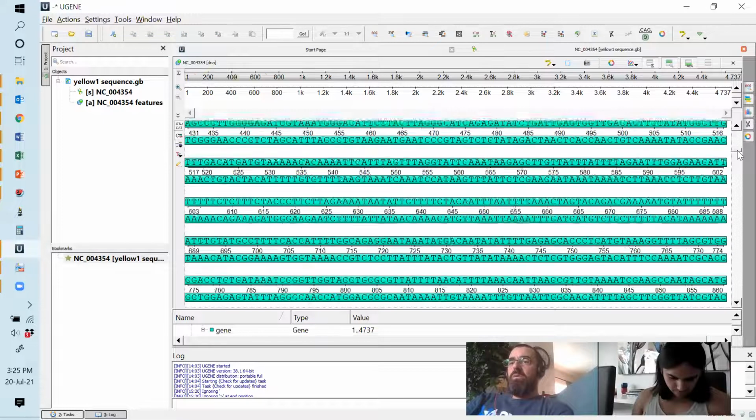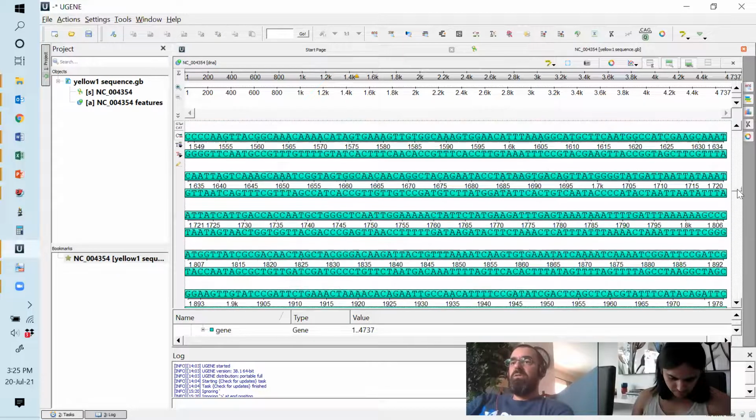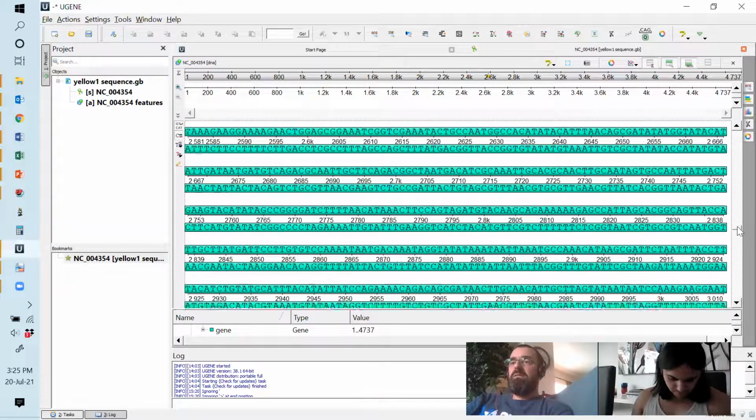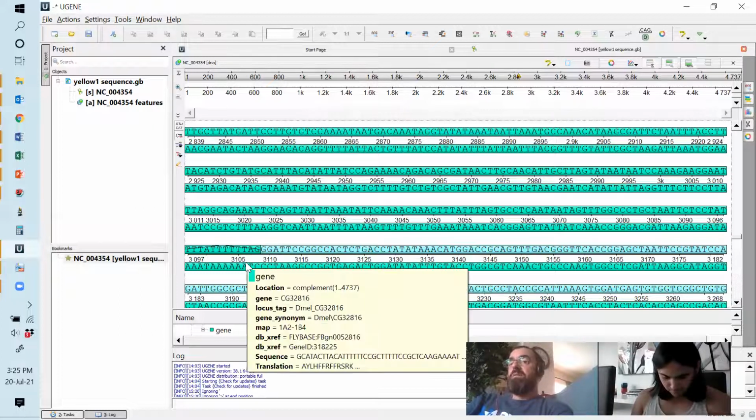And if we scroll all the way down to the beginning of exon 2, which is way down here somewhere. Here we go. We have an AG at the end of the intron, right? So it shows you how conserved it is, that this gene, random as it is, has exactly the same splice site as we were talking about in class.